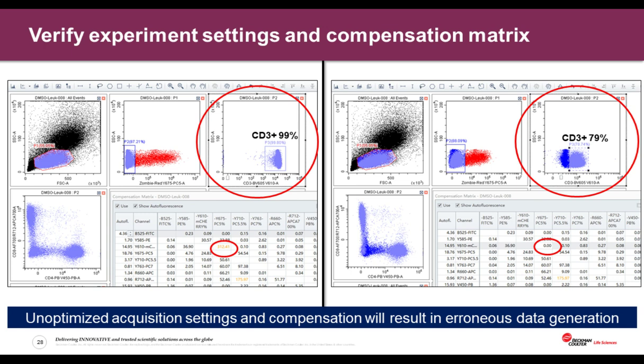The reason why is because I touched upon sample variability. All samples are different. In terms of looking at separation of antigens that are very discrete, sure. But if you are looking at modulating effects, modulated expression of markers, in that case your controls are going to be needed. And those controls are either your day 0 of treatment versus your day 30, or your FMO. So those are going to be needed.